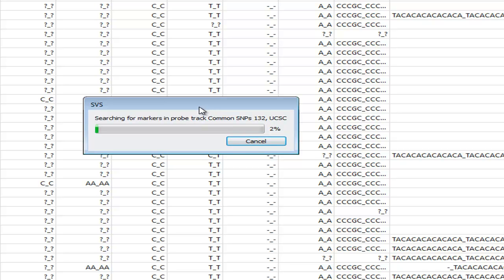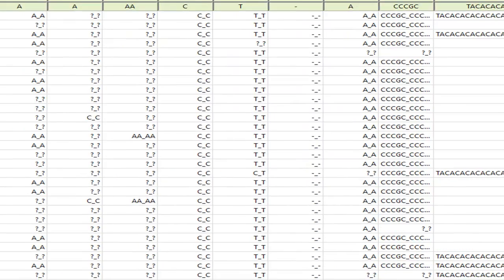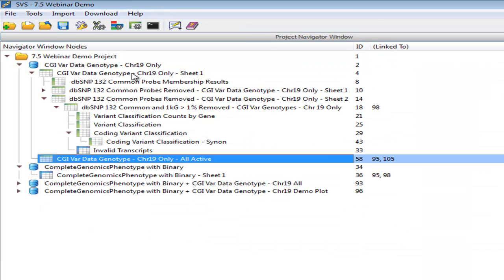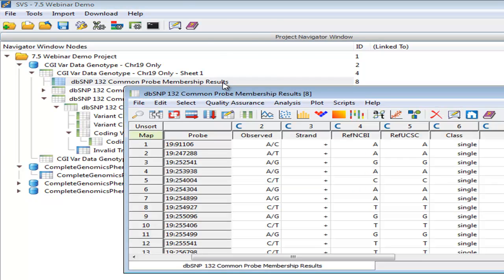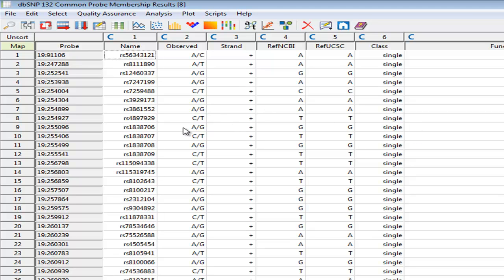Now dbSNP132 common is going to contain only those variants that have been classified as existing in greater than, I believe, 1% of the population for those variants in dbSNP that have enough population information to make that distinction. As you can see, we're moving along at a very good pace here, but I've already pre-computed the results for this, so let's go ahead and cancel and close this and go to the results. Now this is going to be a list of every single one of the variants that are in our spreadsheet that was also found in that annotation track, and all of the columns here are going to be all of the data fields that are present in that annotation track.